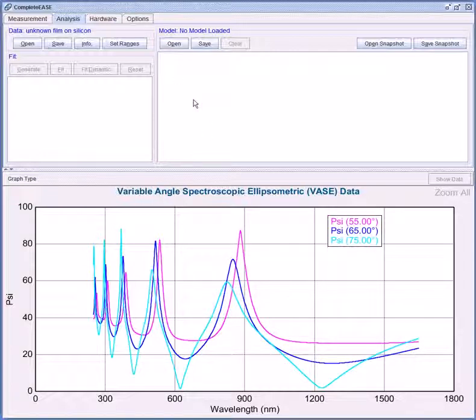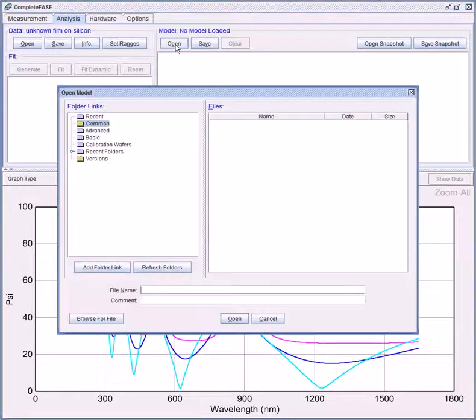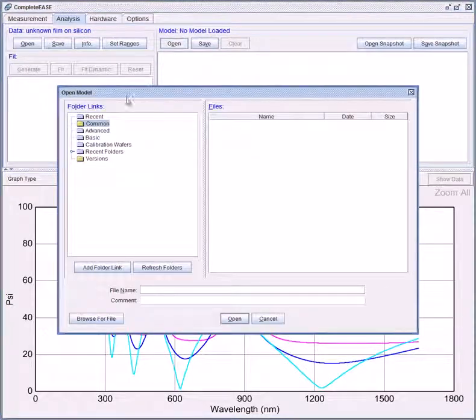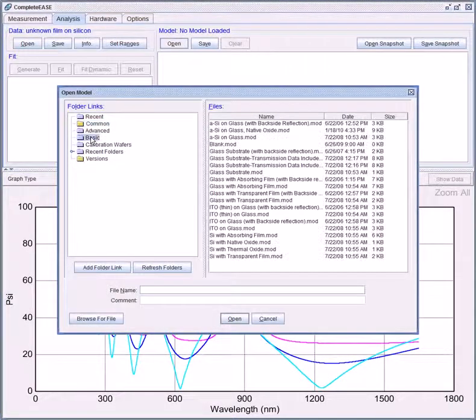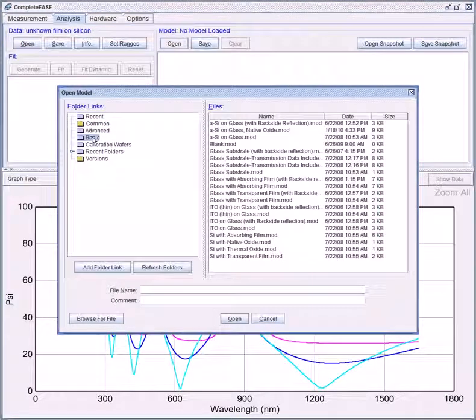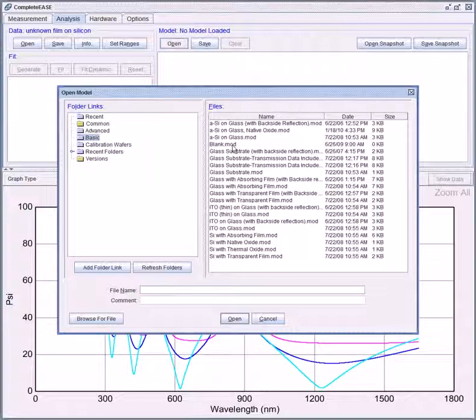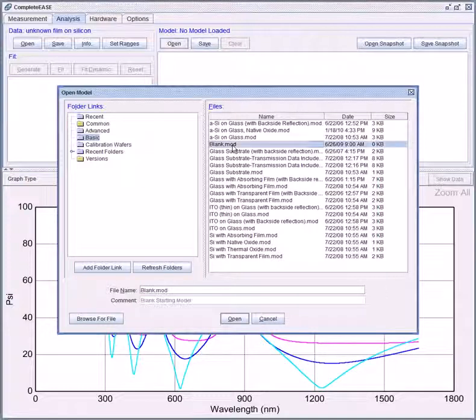First I'm going to open a blank model. In the model panel click open. In the basic folder there is a file labeled blank.mod. This is the empty blank model.